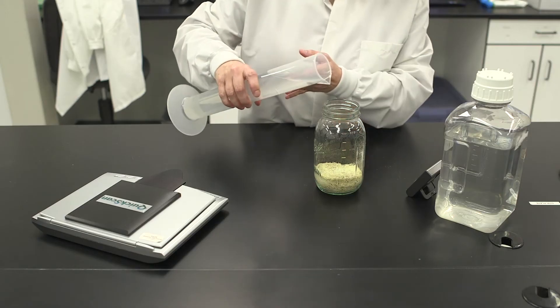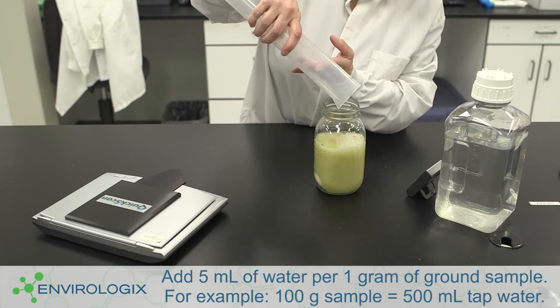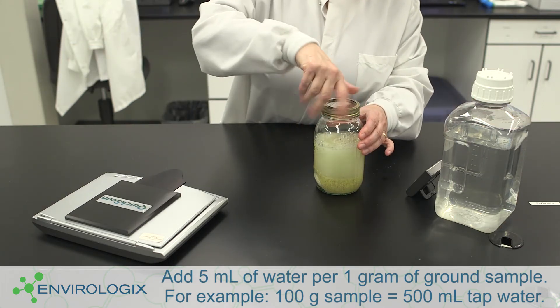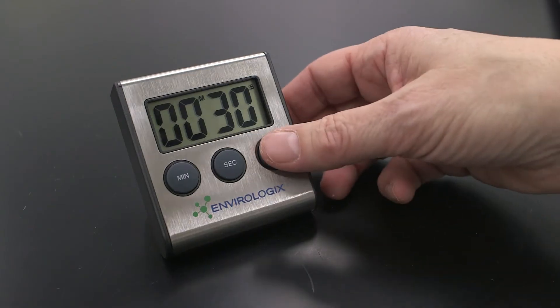Add tap water to the ground soy sample. Seal the container and shake until the entire sample is wet. Continue to shake vigorously by hand for 30 seconds.